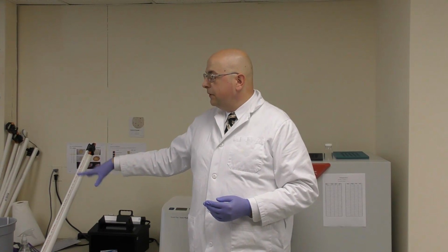We do recommend that you always work in teams. You always have a buddy with you. They're helpful to have to help you hold the lid of the bottle, an extra pair of hands if needed, but also very importantly, an extra pair of eyes that can keep an eye on things and let you know.